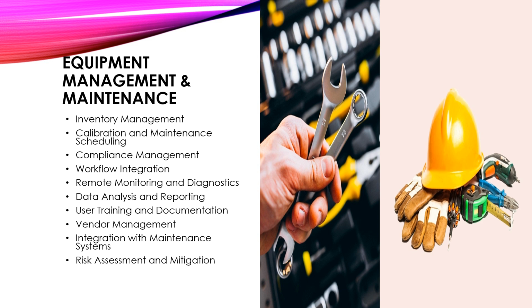Compliance management. Laboratory management systems often include compliance management features to ensure that equipment meets regulatory standards and requirements. This may include maintaining records of calibration certificates, service reports, and documentation for audits and regulatory inspections. Workflow integration. Integration with laboratory workflows is essential for seamless equipment management, and the system should allow users to schedule maintenance tasks without disrupting ongoing experiments or processes. It should also provide visibility into equipment availability and status to prevent conflicts in scheduling.